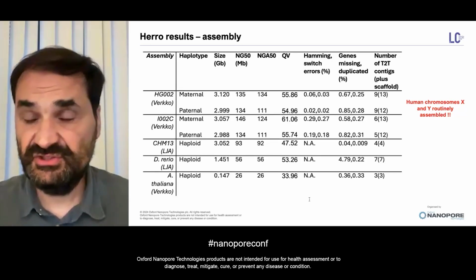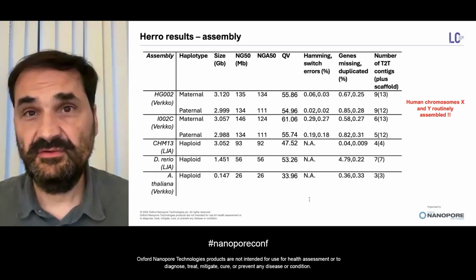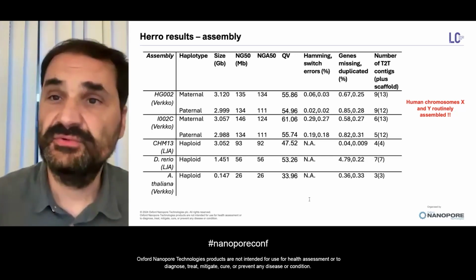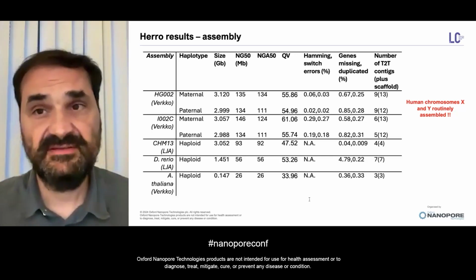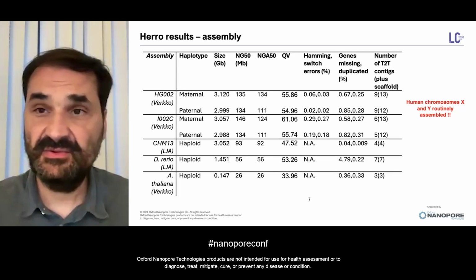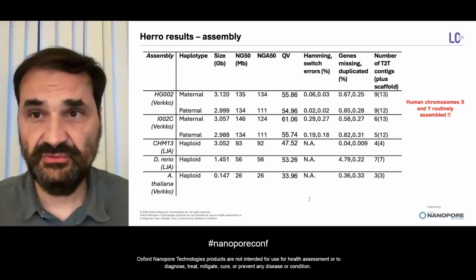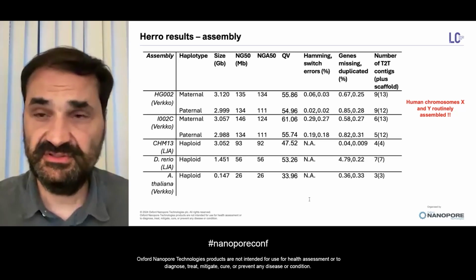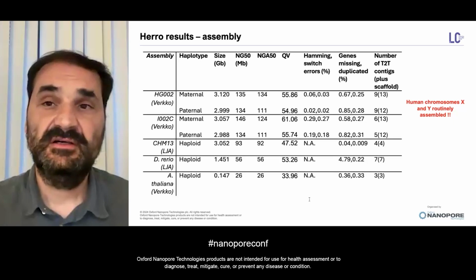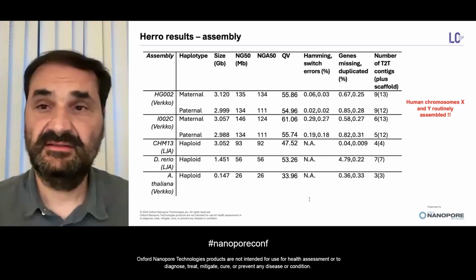This genome was resolved telomere to telomere with quality value of 70, so we can use it for assessments, and it is of high quality. We also use several other high quality genomes like CHM13, haploid human genome, and 2 other haploid genomes, zebrafish and Arabidopsis.